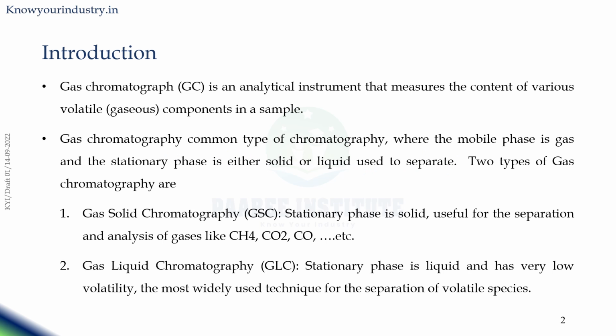Gas chromatographic technique is one of the widely used analytical techniques in pharmaceutical as well as non-pharmaceutical industries, including chemical, petrochemical, as well as agricultural and other industries. The application of gas chromatography is wide, and it is used for the analysis of impurities and in environmental sciences, etc.